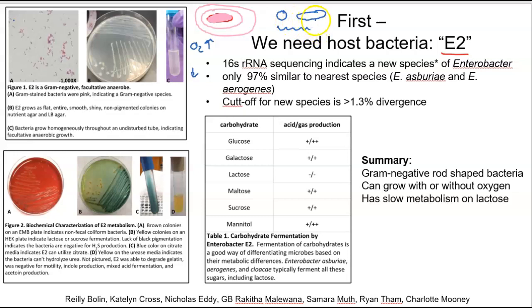And that's how you can actually tell a lot of bacteria apart and identify them from environmental samples or clinical samples. And so we did a lot of different metabolic chemical tests where we see what types of nutrients it can use and what waste products it produces. And so we've got different plates here with different nutrients in them and different tubes with different nutrients. And then you get different colors based on the chemical activity of the bacteria.